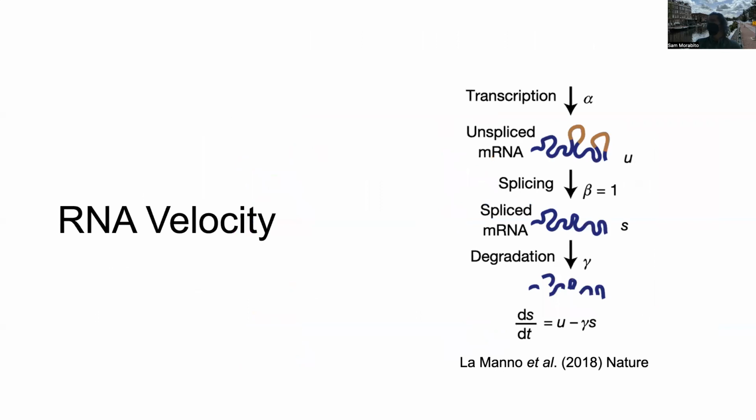As an aside, part of this conversation, I wanted to talk about RNA velocity. This could definitely be its own whole topic, but it's a pretty distinctive set of trajectory inference or analysis tools. It's all based on the idea that when you do single cell, you have a mixture of unspliced and spliced RNAs.